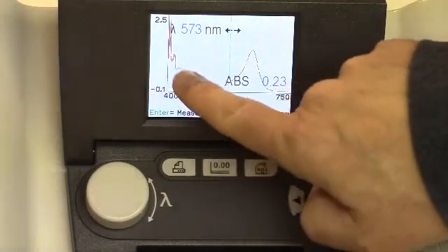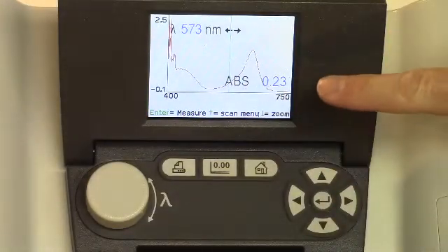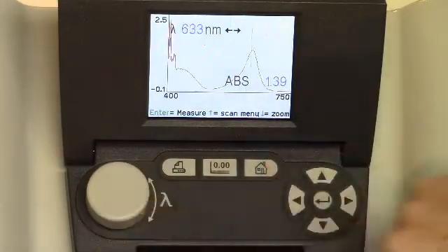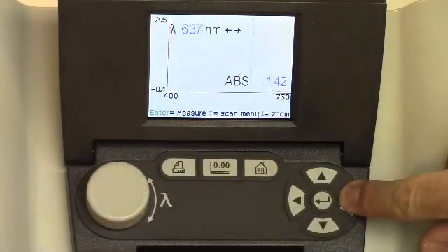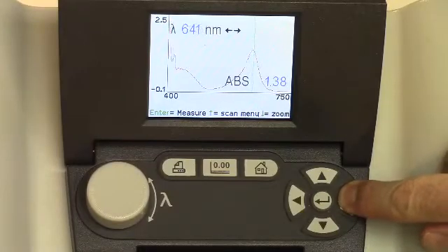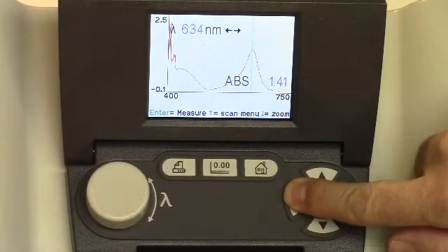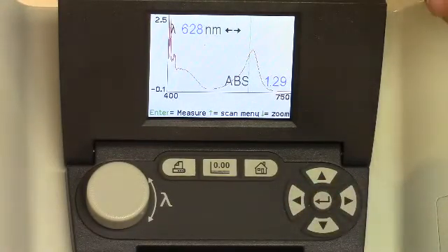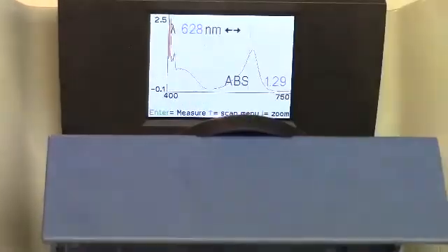We've got some stuff going on over here. I'm going to ignore that, but there is a little bit of a peak here. Typically though, what we're looking for is the wavelength of maximum absorbance. So that's going to be this one over here. So let me dial it over to this side, and then we'll just scan across there like we did before. Very simple to do. We're trying to find that wavelength that has the largest absorbance. That's where the most light is being absorbed for that sample. So there was the green one.